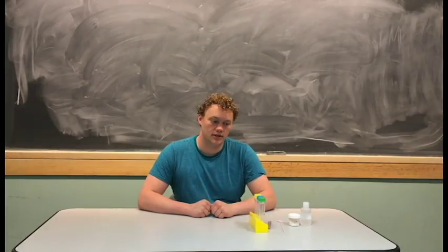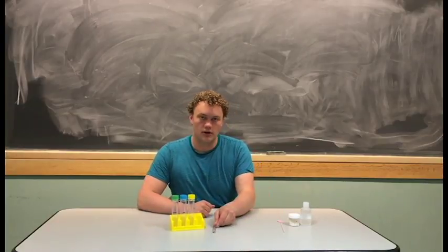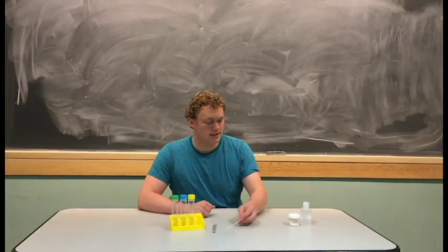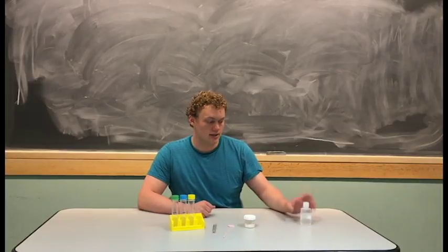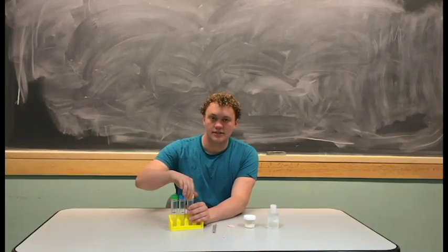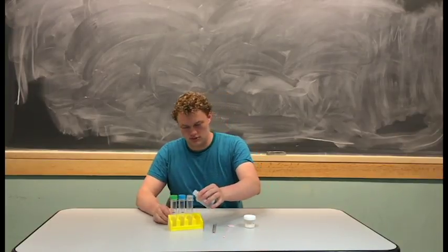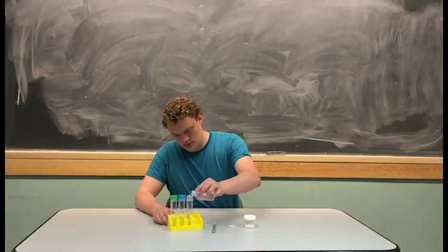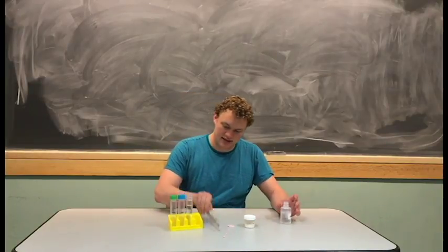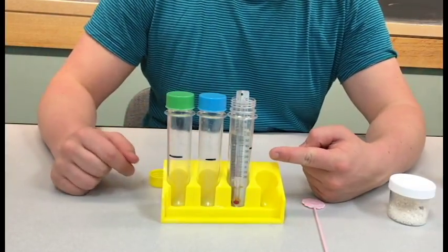Next, the students are going to do an experiment. Pass out the test tube rack, thermometer, plastic stirrer, ammonium nitrate, and water. They'll fill one of the test tubes up to the mark with water, and then take the temperature. The students should look at the thermometer and record the lowest temperature on their observation sheet.